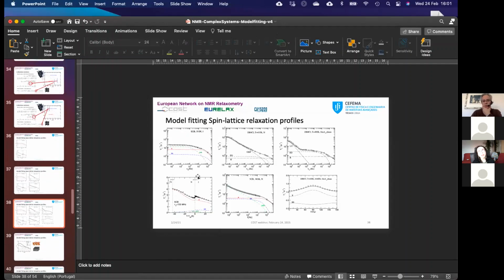On the other hand, one could use what people often call a model-free description, which actually merely means that, because we cover in field cycling around 4 decades in frequency, and at the beginning the curve is in most cases flat, if you fit the data with three Lorentzian functions, you will probably also reproduce the data quite well.